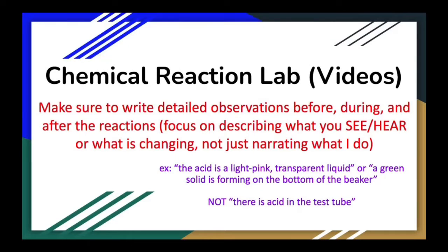In this recording, I'm going to go over all of the different experiments that we did in our chemical reaction lab with the 6 different stations, so that if you're absent or if you need to revisit them in order to be able to fix or finish your observations, then hopefully these will help.